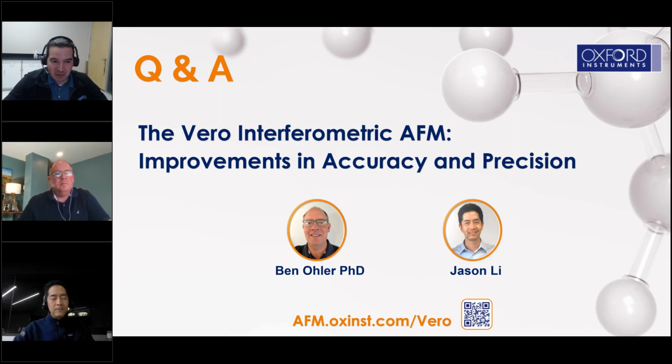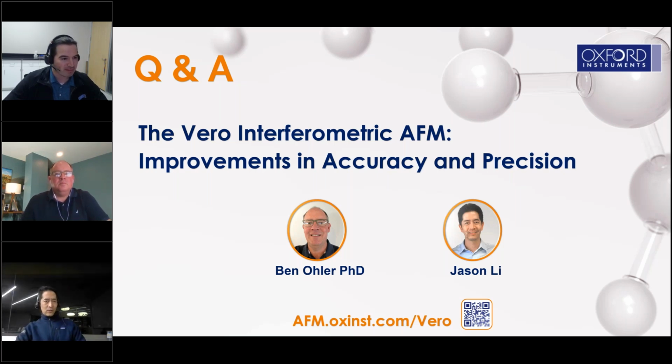So another question, Jason, why is Vero not influenced by the changing angle of the cantilever? Yeah, good question. In the OBD, that angle is actually redirecting the spots on the photodetector, changing the measured signal. With QPDI, that beam is still changing angle, but there's enough overlap of the return beam, so enough signal is getting back. And if you think about how an interferometer works, it's looking at the interference between the reference beam and the sample beam, the two beams that we're sending to the cantilever. So long as that happens, you still have a signal. For very large deflections, you might lose some signal, but the measurement of displacement is still there.